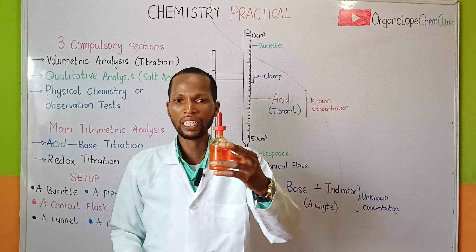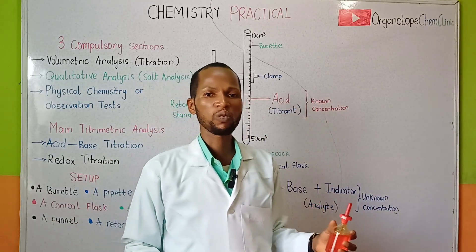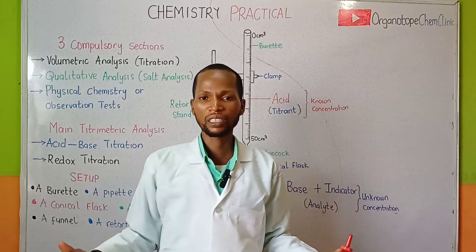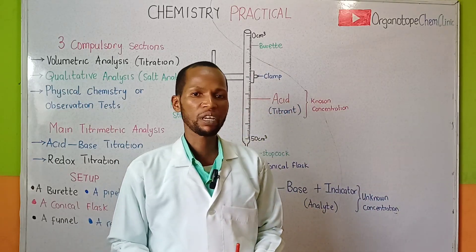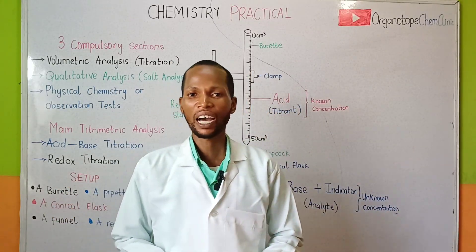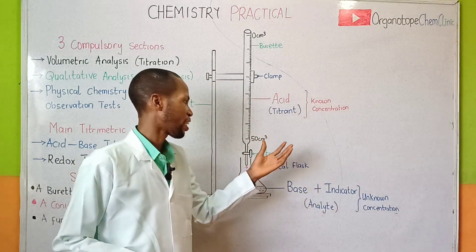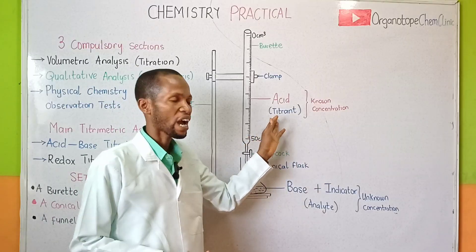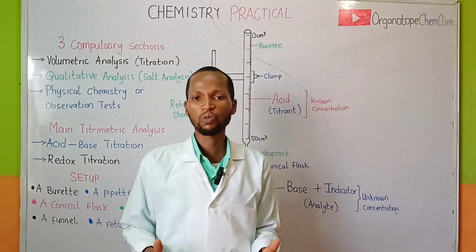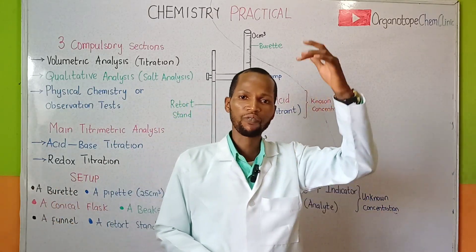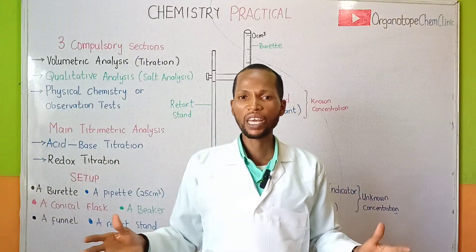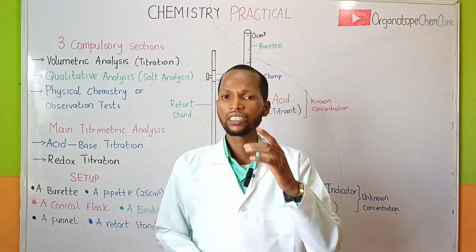The indicator is a dye — we need to add it to our analyte before we commence the titration. This is methyl orange, an indicator for titrometric analysis. We use methyl orange when dealing with strong acid/strong base, or strong acid/weak base titrations. We add this indicator to our analyte because the solution of the titrant (the acid) and the solution of the analyte (the base) are both colorless, and we need the indicator to identify the color change that signals the end point.